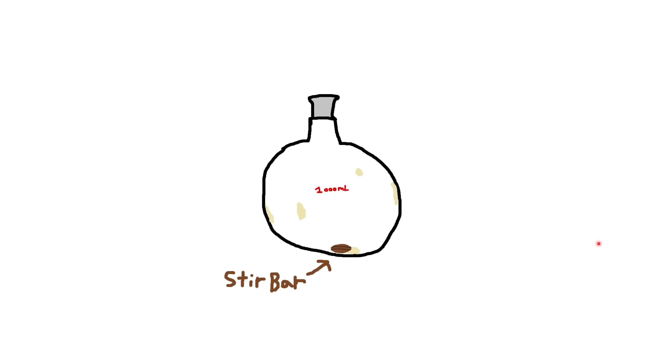So initially we had this flask with some tar, and you might be thinking, well, normally tar is black. However, in organic chemistry, you can have tars of every sort of color. I have had a rainbow of tars in my time. And this time it happened to be this kind of ugly-looking peach-colored tar. And I also had a stir bar in there, a brown stir bar, and that stir bar was going to be seeing some action today.